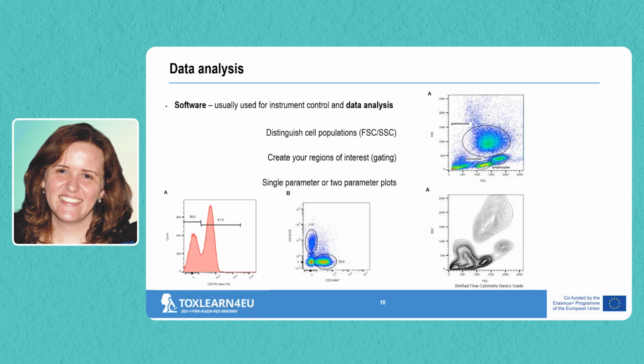And then we can have two parameter plots. So you can have side scatter or forward scatter, wherever you want, you can plot it here. So this will correspond to any of the detectors on the Y and X axis.